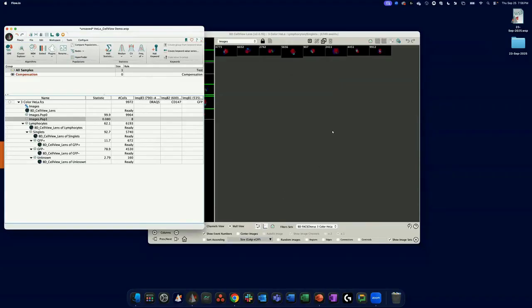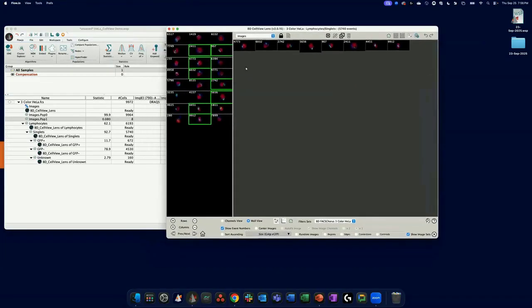Of course, this could be a much larger list, but I'm sure you get the idea. So here I can have those 8 images that I can always go back to and the representative cells. Okay, and then there's like a not gate, which is basically everything that was not in those 8 images. Okay. So image sets can be very powerful.